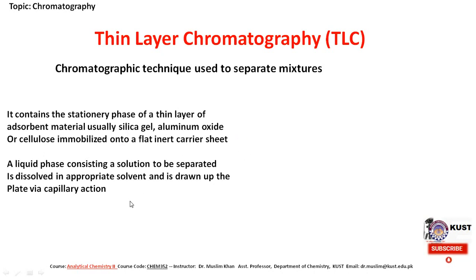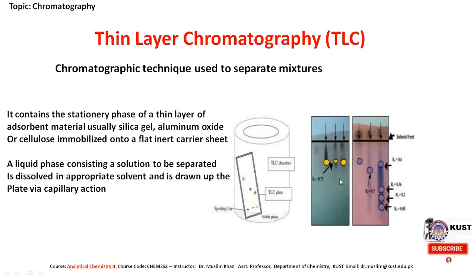And a liquid phase consisting of a solution to be separated is dissolved in an appropriate solvent and is drawn up the plate via capillary action. So this thin layer chromatography is having different components. The TLC system, as we usually call it, consists of TLC plates. These are the TLC plates.